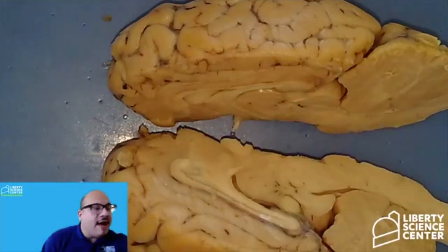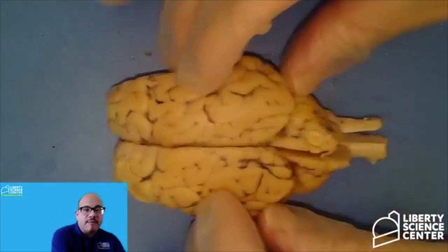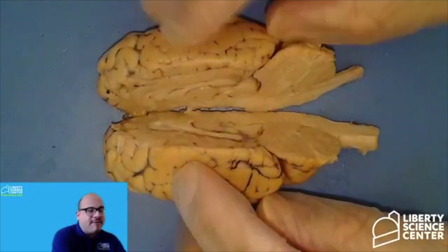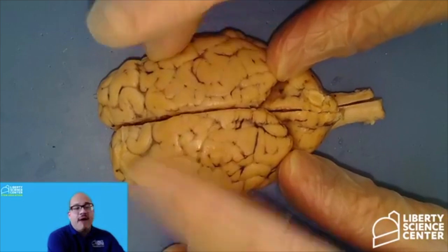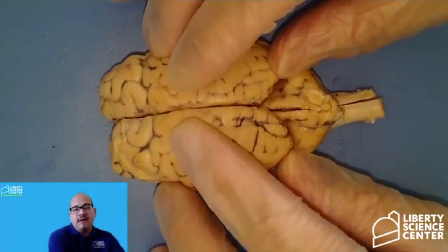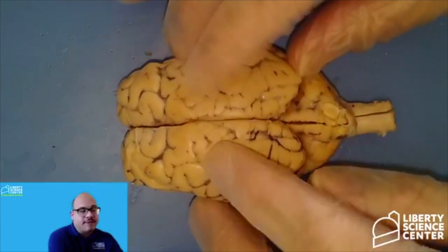All right, so let's see. Other questions. Why is the sheep brain yellow? Excellent question. That's because of the preservative used by the company to make sure that the brain doesn't decompose. Also, I have a light, so depending on my brightness level and everything, it looks very yellow in color. But brains are very pink in color. They're not super bright pink, but they have a pinkish tinge to them.